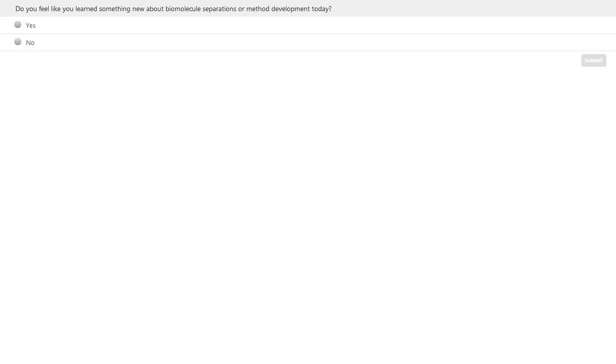Okay, thank you. Next question. You mentioned that TFA is commonly used for LCMS, but I read in the literature that TFA can form ion pair in gas phase, which will suppress the ionization. So I thought formic acid was more popular. Is that wrong?